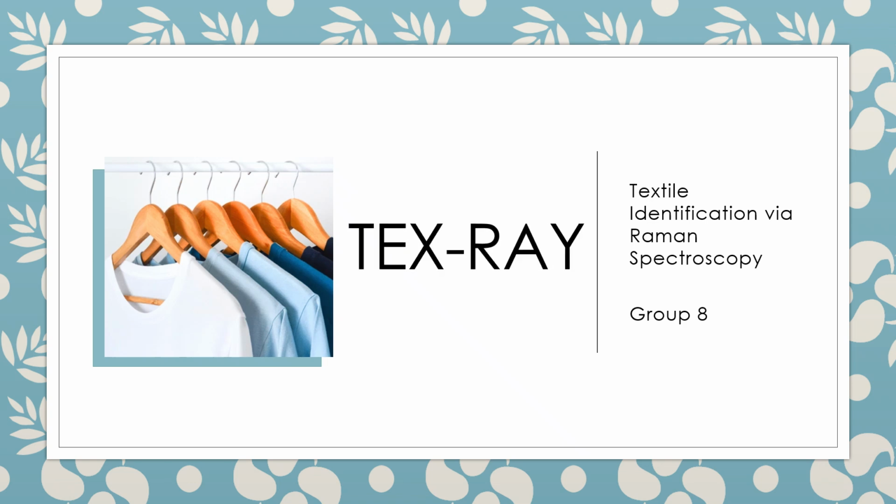Hello all, welcome to our critical design review presentation. Our project is TEXRAY, textile identification via Raman spectroscopy.